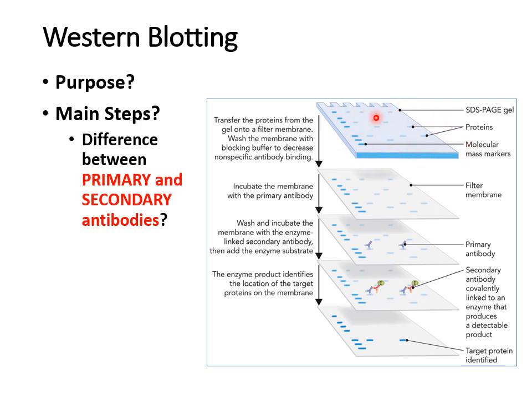Basically, you end up using antigen specific antibodies to identify the exact proteins that have been spread out on that gel. Now, the main steps: you have that gel that you ran. You then transfer it to a special filter membrane, usually called a nitrocellulose filter, which has pores that the protein sticks to.